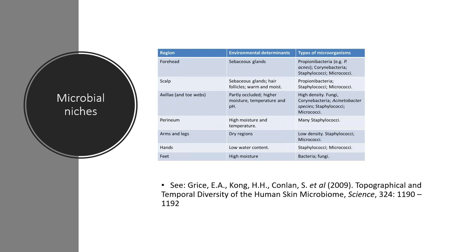And it's one of the myths that needs to be challenged, that gram negatives are not associated with the human body, when in fact there is now growing evidence that there are gram negatives associated with the outer layers of the human body, particularly Acinetobacter and Paracoccus. So this information again is fairly useful background information if we do start seeing particular types of organisms found in particular changing rooms or clean rooms, and we do have worries about gown control, mask control, glove control, then potentially there may be a connection here that we can relate the data back to.